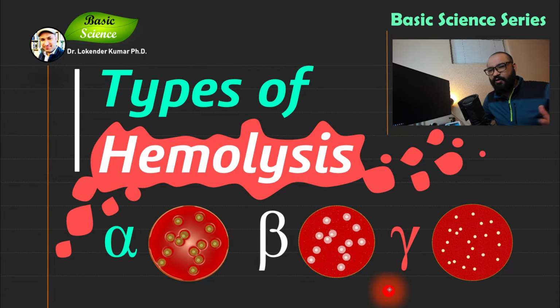But right now, gamma hemolysis indicates the hemolysis that is given by Enterococcus faecalis, and basically it's non-hemolytic, or there may be some kind of weak alpha hemolysis after 24 hours. But it's really self-contradictory that gamma hemolytic bacterial species, basically they are non-hemolytic.